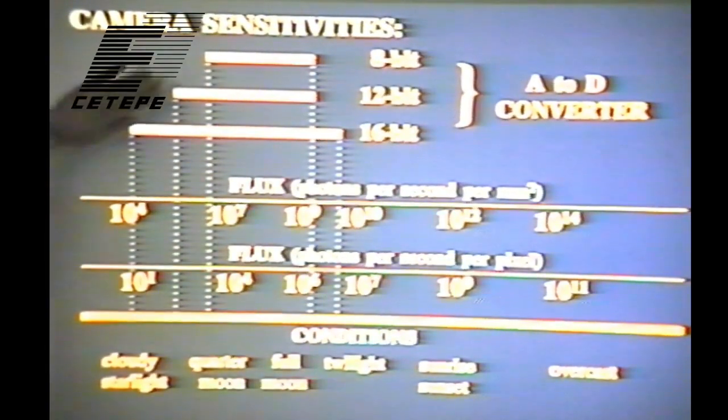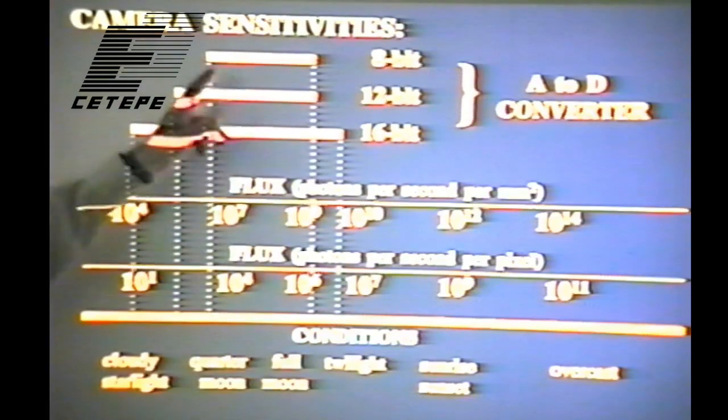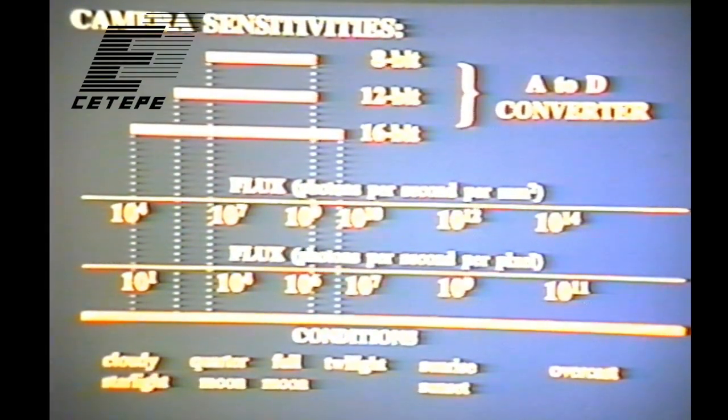And these numbers correspond to this amount of illumination. So a consumer camera, all of them can function in daylight. But then at daybreak or twilight, they can all still function. With an 8-bit camera, you might get a very hazy picture, all the way down to moonlight. But you can see that with an almost totally dark night and cloudy starlight, you can still take a picture with these cooled slow scan devices because of that very low noise.